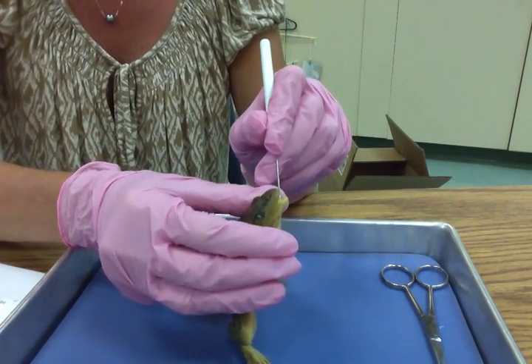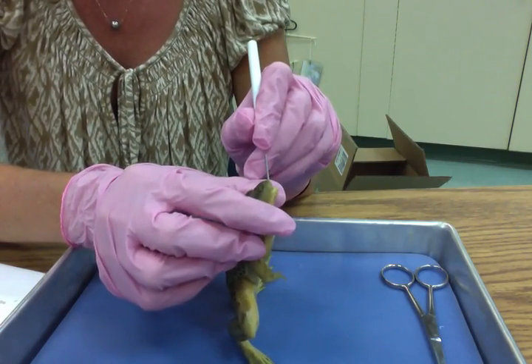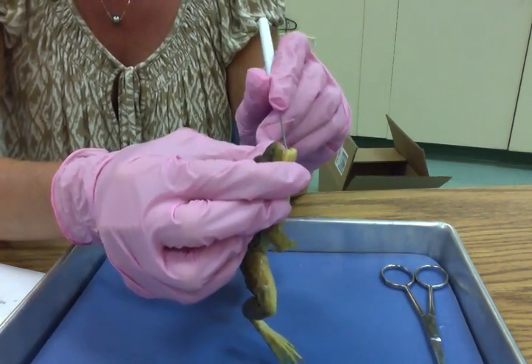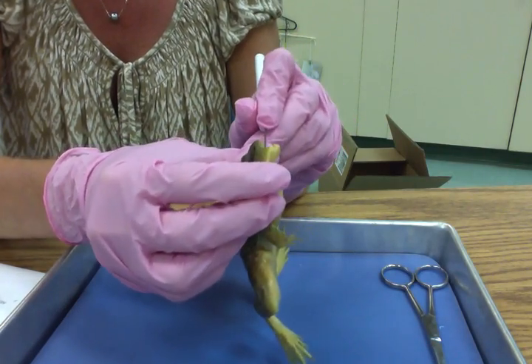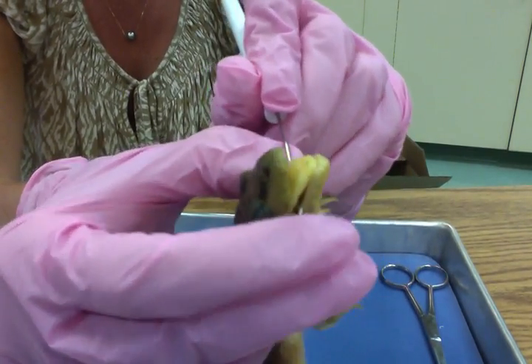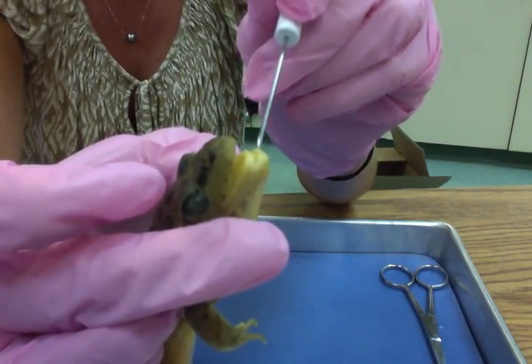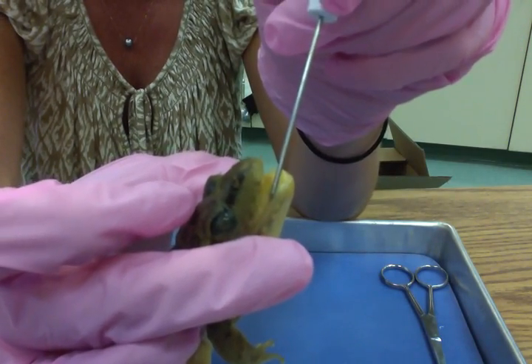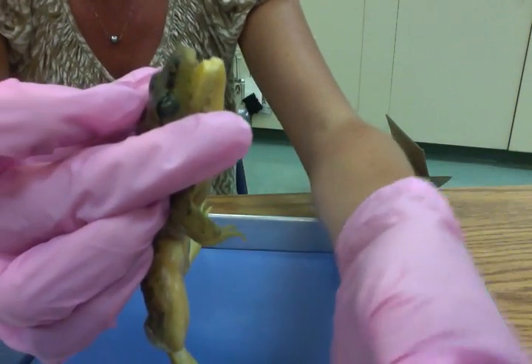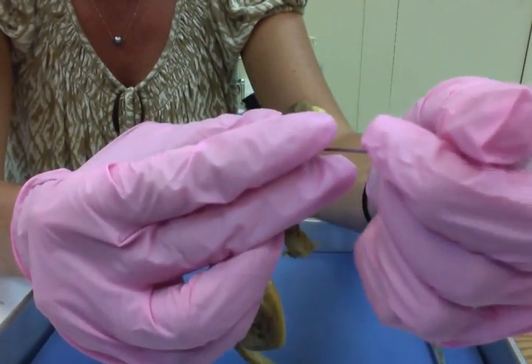So, right, our tongues are kind of connected to the back of our mouth. And when we stick our tongue out, it doesn't go very far. But we've all seen a frog, for example, catch a bug, and we know that its tongue goes out very far. So a frog's tongue, I know that's probably not very clear. A frog's tongue is connected to the front of the mouth. And so what we can do is pull the tongue out from the back of the mouth.